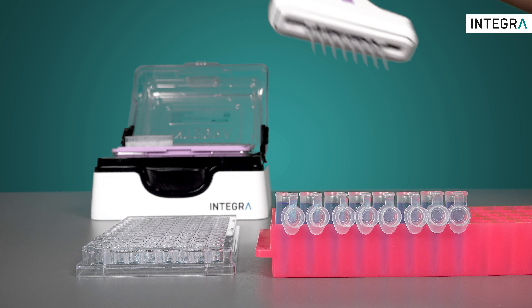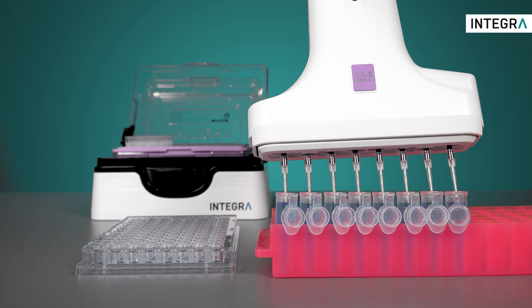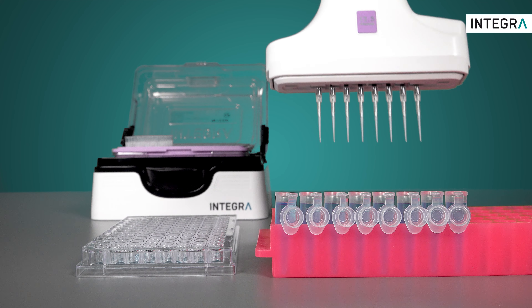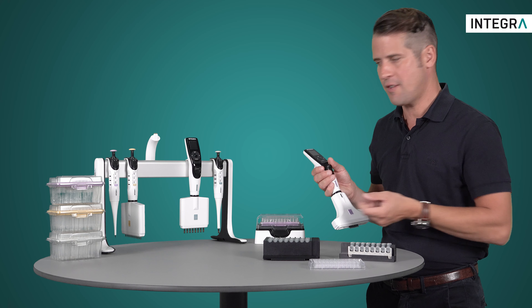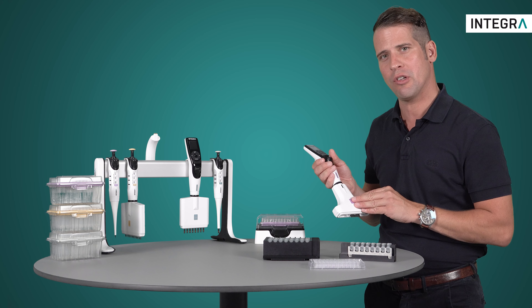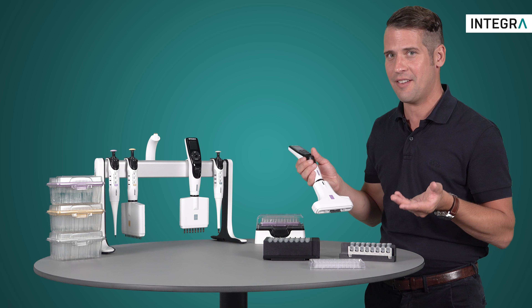The same programming principle can be applied to tube-to-plate transfers as well. The Voyager pipette was made to give you all the advantages of a multi-channel pipette with these tricky reformatting protocols. And the programming is a cinch, especially adding the tip spacing.